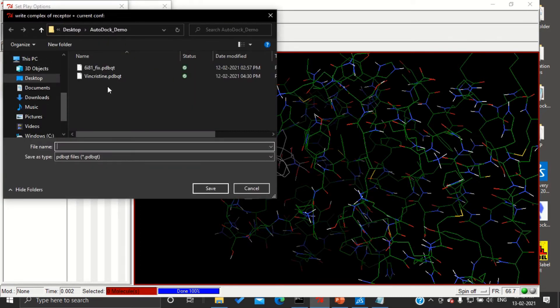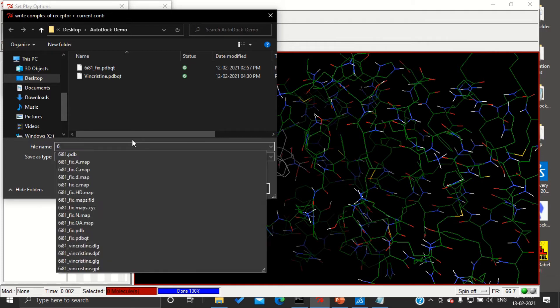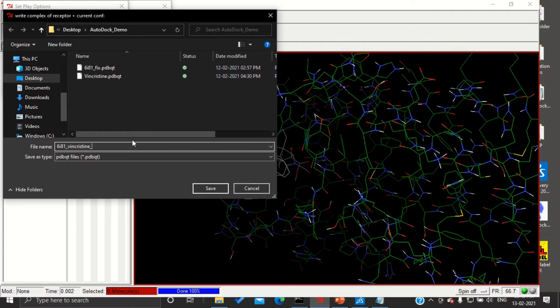We are going to save our complex in pdbqt format. I am going to give the protein name first, that is 6i81, followed by the ligand vincristine, and then followed by the run number, that is run 5 dot pdbqt.